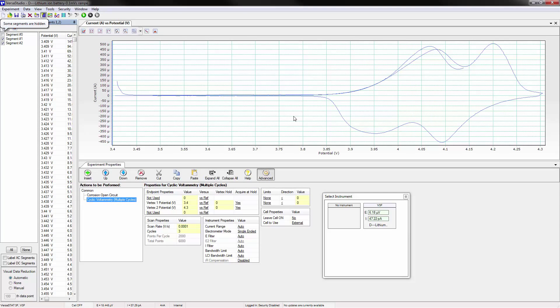With Versus Studio's new window docking layout, users can view and access the select instrument and data view windows in the layout that satisfies their individual preferences.